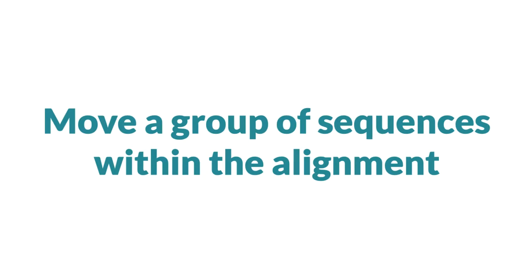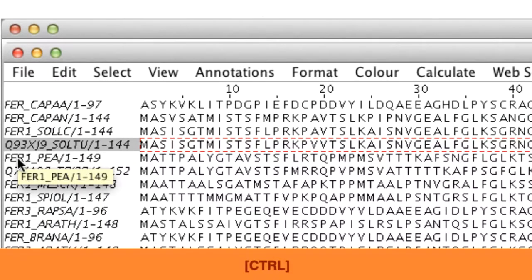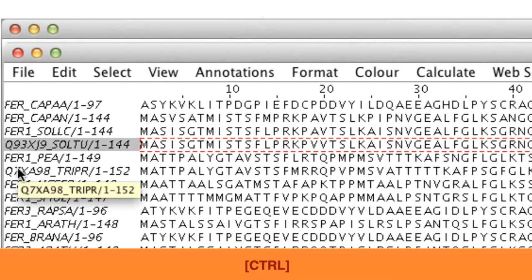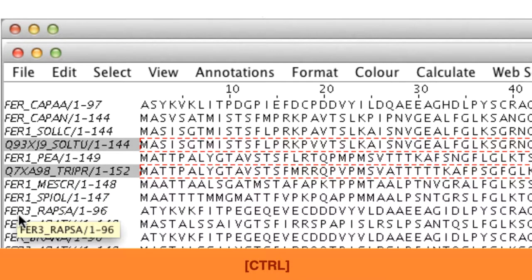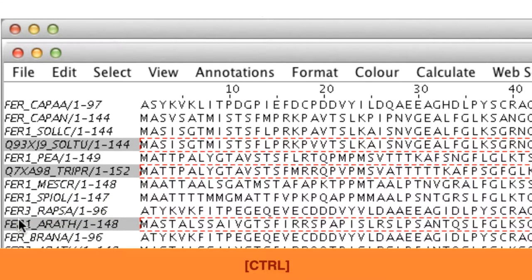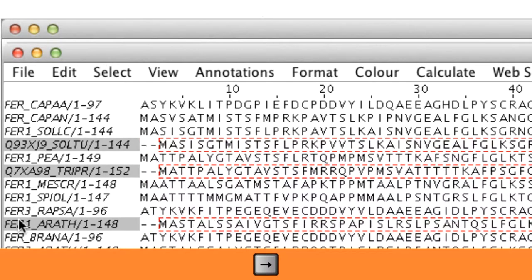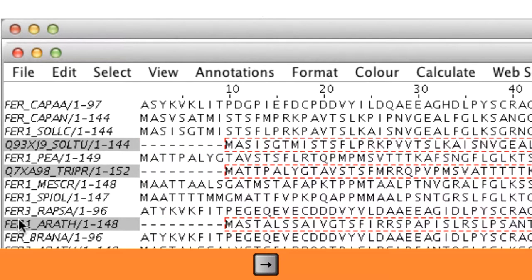A group of sequences can be moved within the alignment. I hold the CTRL key as I select the sequences by clicking the left mouse button. This selects a group of sequences. I use the right arrow key to slide all the sequences along to the right.